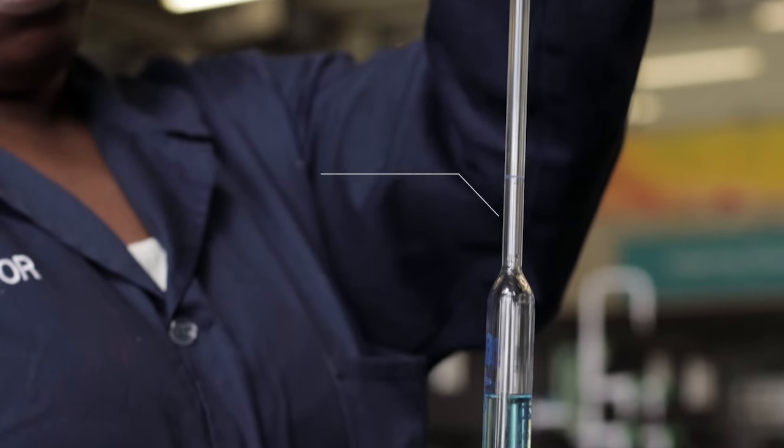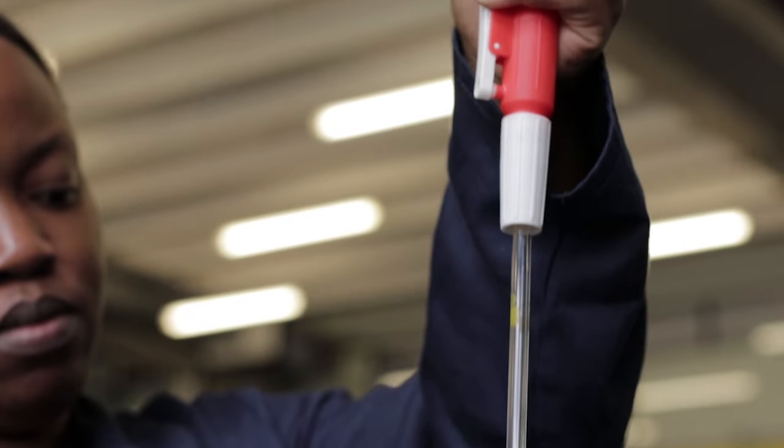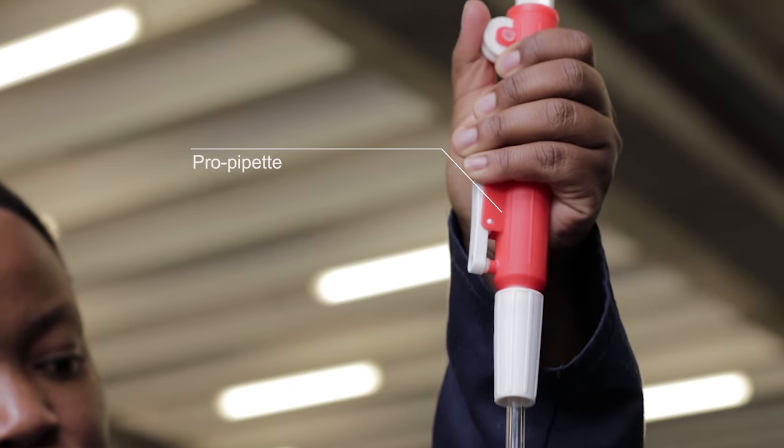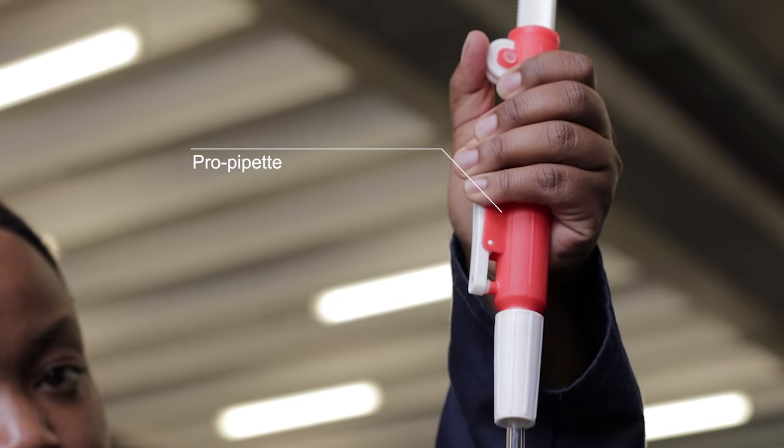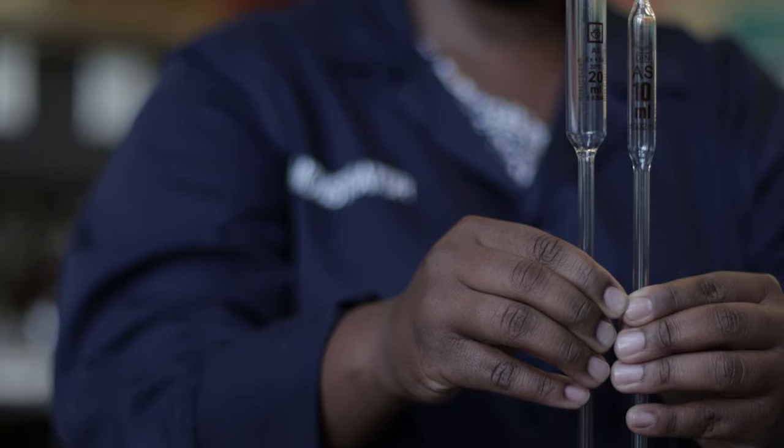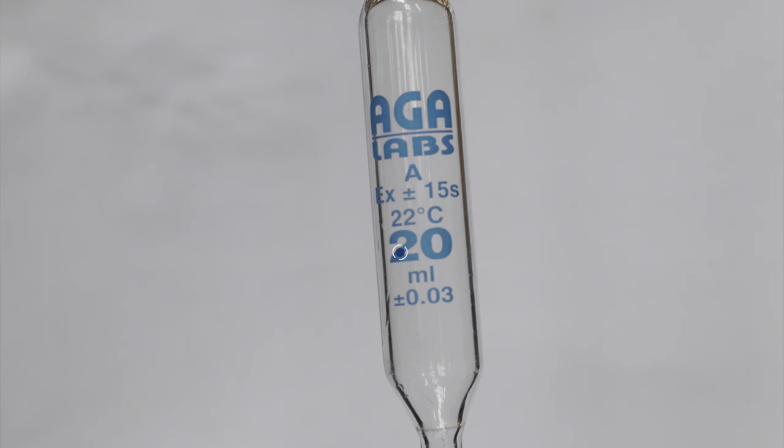A pipette is used to measure a volume of solution with extreme precision. This is done by using a pro pipette to suck up the solution. Pipettes are found in different sizes. This is the volume of the solution to be delivered which should be recorded as 20.00 millilitres.